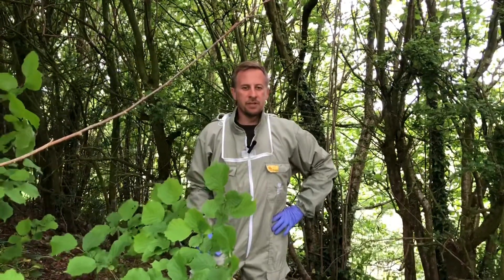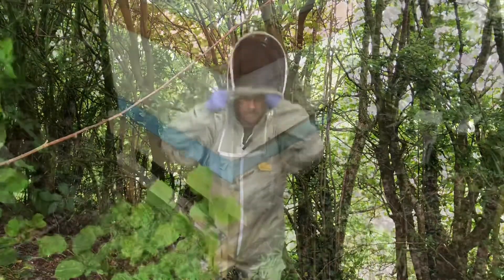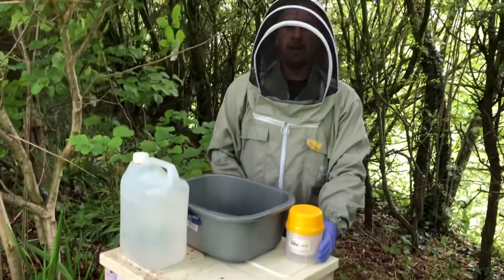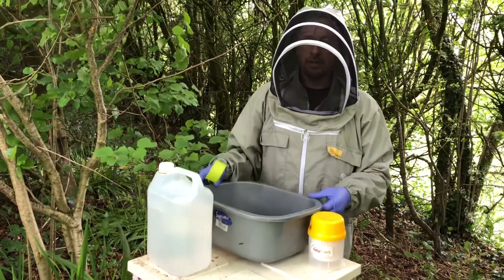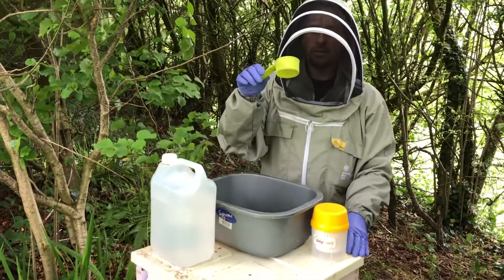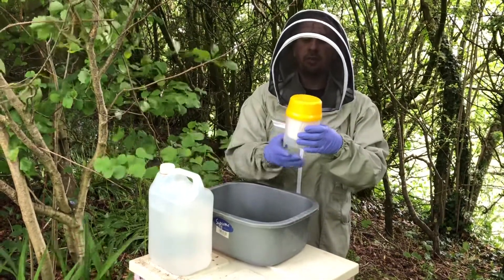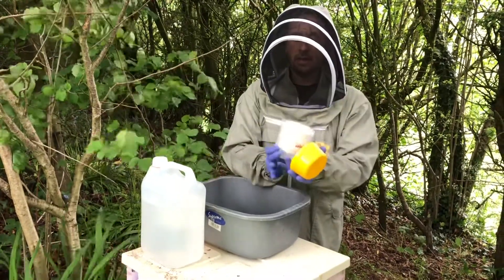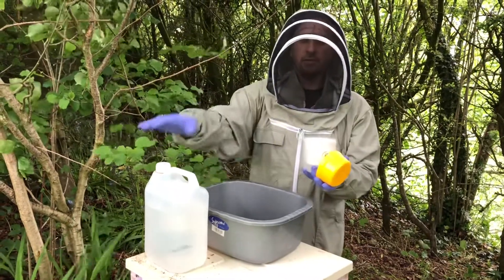We've moved into the apiary. There are four things we need to carry out this method: a bowl of some kind to shake the bees into, a half-cup scoop, a store-bought mite checking device — which you can also make yourself — consisting of a cup, a lid, and a basket inside to suspend the bees, and of course our alcohol.